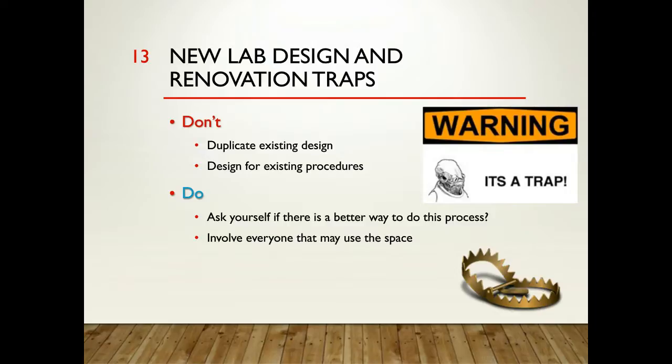Some design traps that I want to highlight is to duplicate your existing design. So don't just replicate the existing design of the lab. Look at the layout. Make sure that it's the best case for you. Also, don't design for existing procedures. As I've mentioned before, you want to make sure that you're designing this for future use and for flexibility and also for the best safe procedures. Is there a better way to do this process and then involve anyone that may use the space in the design process?